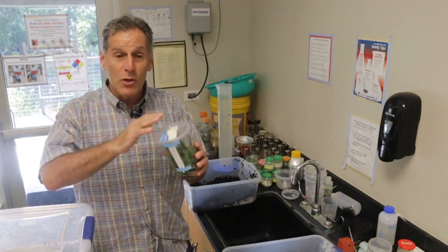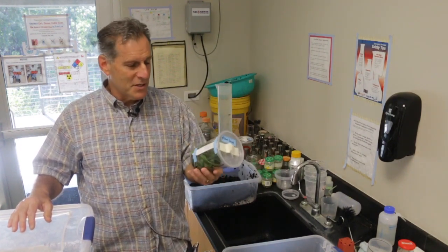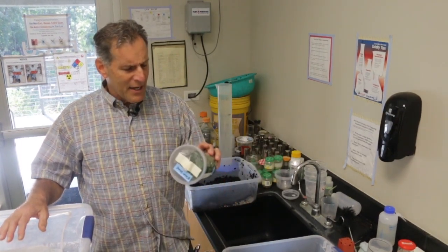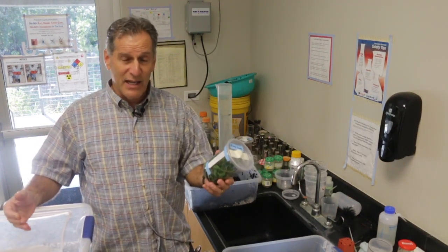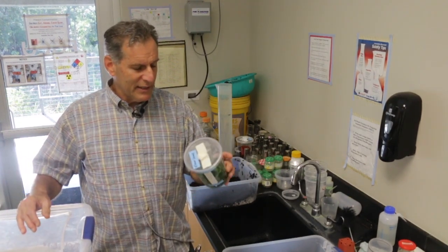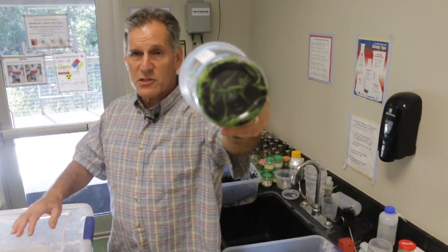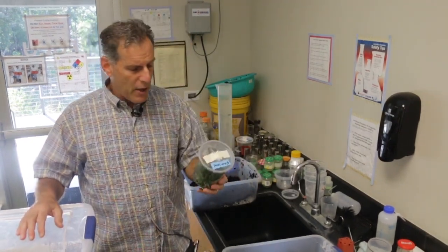All right, so anyway, moving on to the deflasking here of this flask. This is one of my hybrids that I've had in the laboratory for a while, and I'm starting to get a little bit of browning on some of the leaves, and it's not an indicator of any kind of fungus problem or anything like that, but it's an indicator that these guys want out. The amount of root growth on here is pretty high, and they just need to come out.